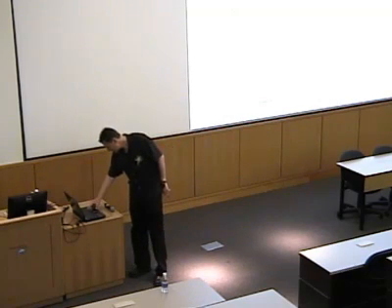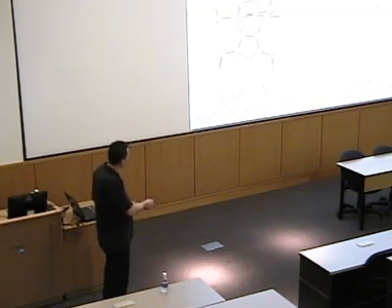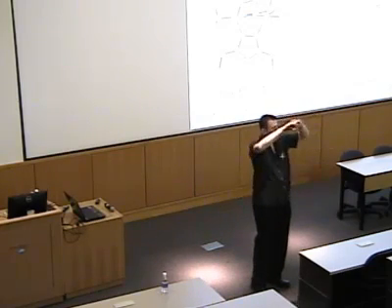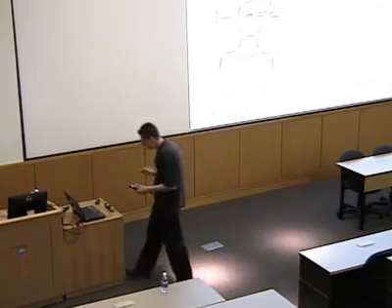The other thing is, of course, resolution. And this is actually the first MCD spectrum I'm showing, right? Of course, it's intrinsically clear, but just to underline, MCD is like a CD spectrum. It has a sign, right? So you can have transitions that are positively signed, transitions that have a negative sign. And what that allows you to do is get a much better resolution of optical transitions. If everything is positive, maybe you end up with a big absorption band, like a big block. But if some are positive and some are negative, you can identify individual transitions much better. And here's one example that shows this.